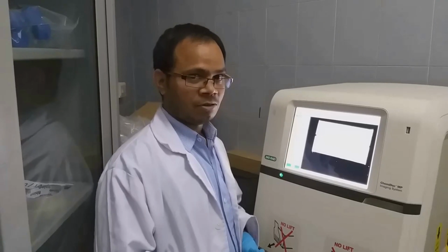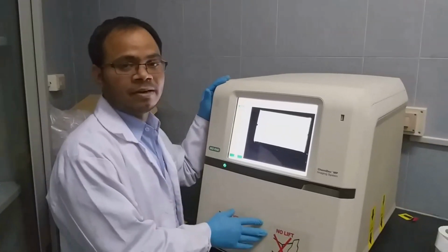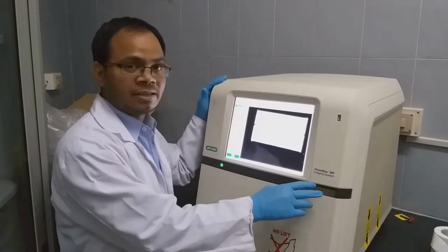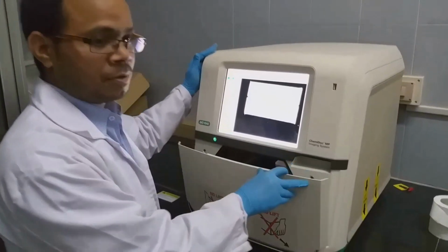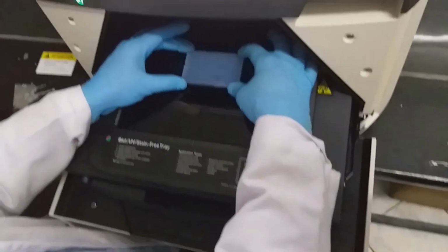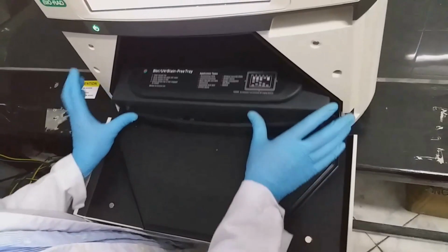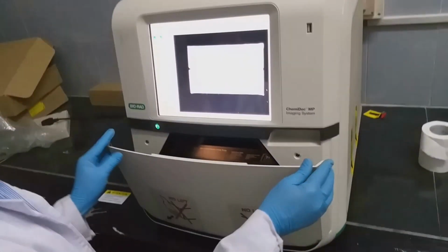After the agarose gel electrophoresis, we have to visualize the amplified product. This is the ChemiDoc MP, where we are going to visualize the amplified product. Now we have to keep the gel, then close the lid.